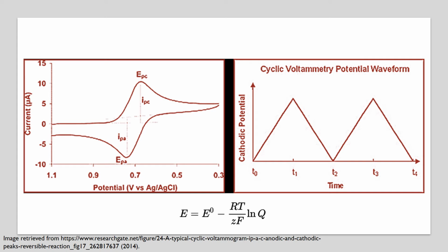The redox data is recorded in a graph called a cyclic voltammogram. It shows the applied potential in voltage on the x-axis versus the resulting current in amps on the y-axis. Various parameters can be altered to fit the experiment, including scan rate, starting potential, and final potential. If potential is swept positively or anodically, the analyte in solution reacts with the electrode, forming a peak in the voltammogram, which indicates oxidation. At the switching potential, the direction is then reversed and the potential runs negatively or cathodically, which forms another peak, indicating reduction of the analyte.